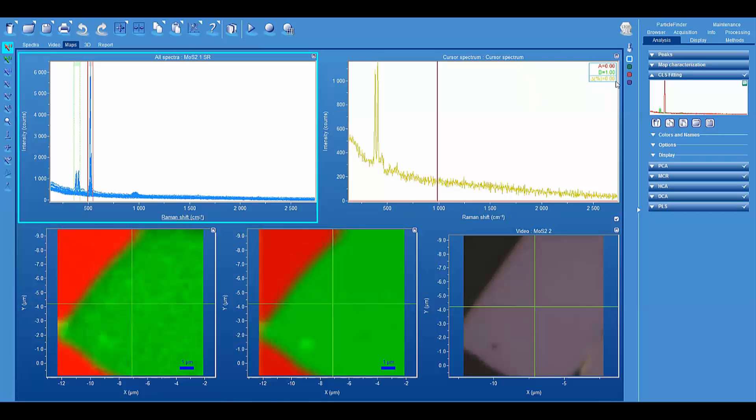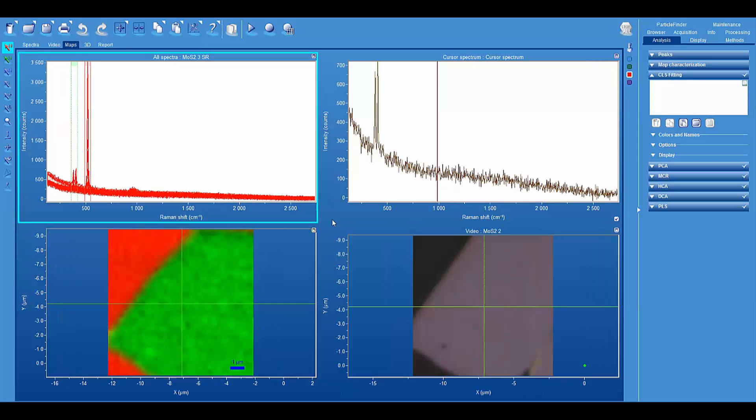And let's now move on to, and this is a 100 millisecond integration time per point. Now let's look at 50 millisecond integration time per point. And so you see the signal to noise is dropping because of our lower integration time. However, in situations like this where you basically have good chemical contrast between the spectral information of the silicon and the molybdenum disulfide, then the signal to noise ratio that one needs to produce the image is not as great as one might expect.